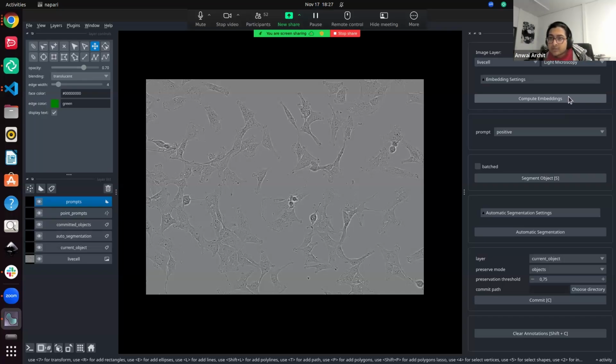Another question. Thank you for doing this. Perfect. Thank you so much for your question, Vasant. Yeah, so extracting features, giving them to the next backbone so that they can process it a bit more efficiently. So we compute the embeddings over here.